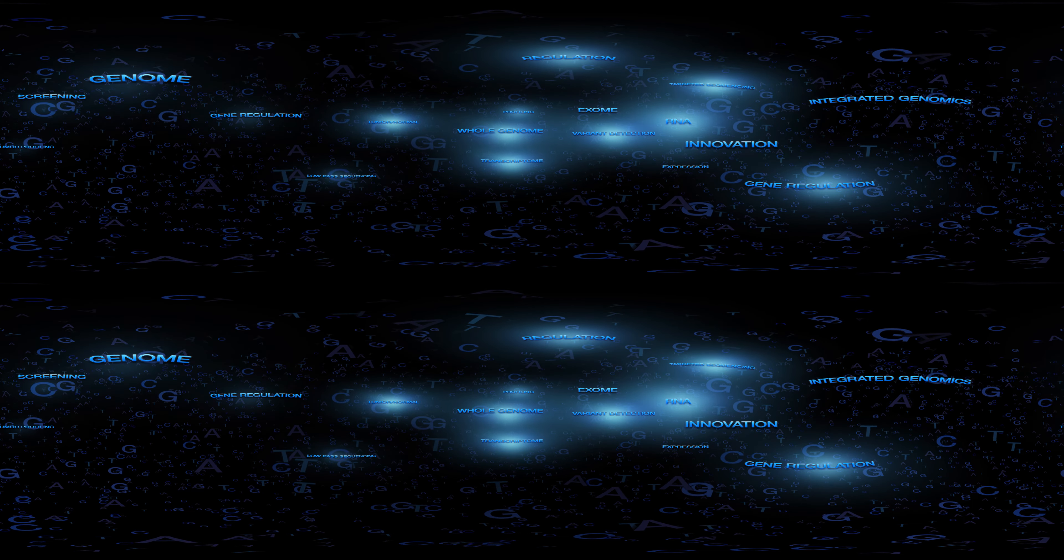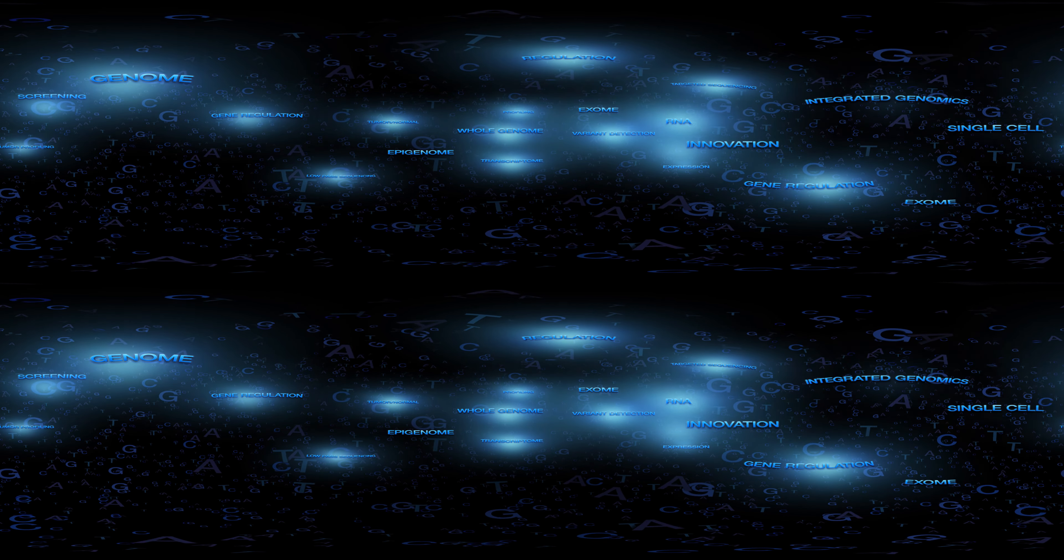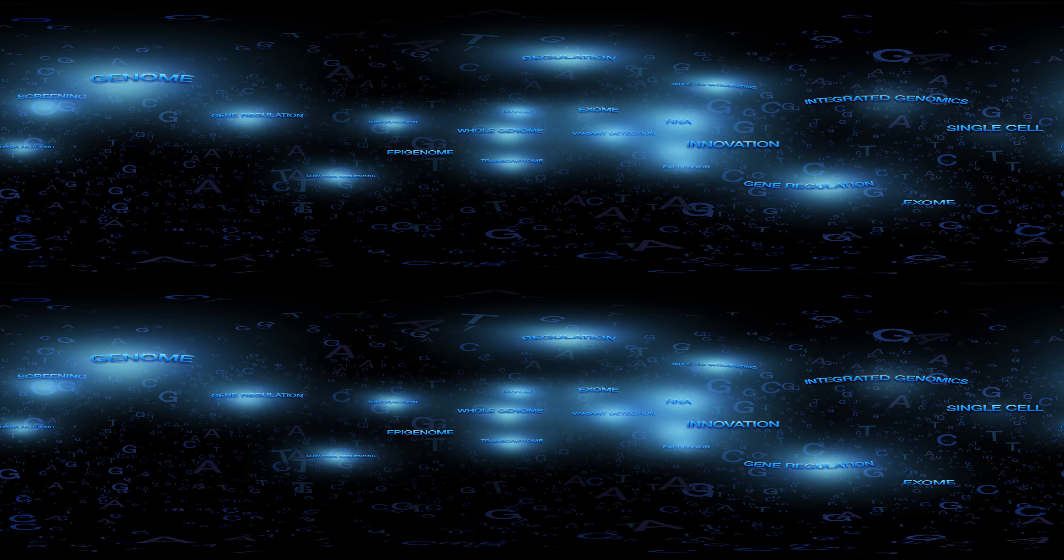Conduct larger and more powerful studies than ever before. Discover infinite possibilities. All on one platform.